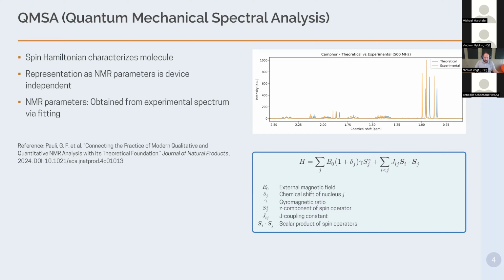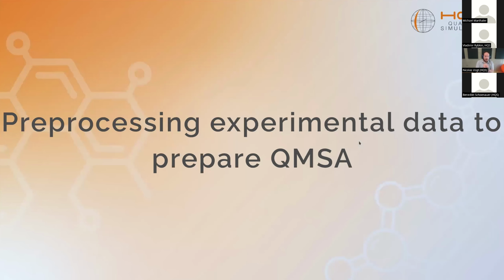a specific molecule. All right, so this is, in a nutshell, in a very brief summary, how QMSA works for getting digital references for NMR. Before I hand over to the mixture discussion, however, I want to say a few words extra about something that's very important if you want to recycle old data and maybe not ideally preserved data for this kind of QMSA procedure, or in general for working for post-processing NMR spectra.